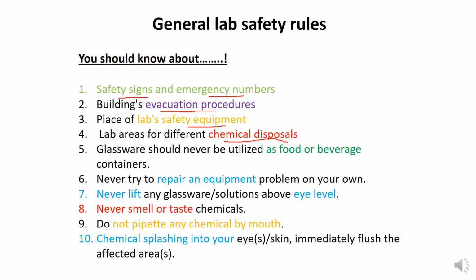Glassware should never be utilized as a food container. So this is, I think, the new rule that we did not cover. Okay, so this is very important. Because we have very decent glassware, especially in chemistry labs and bio labs, and those look very beautiful, you should not use them for any beverage or food containers. This is one thing.